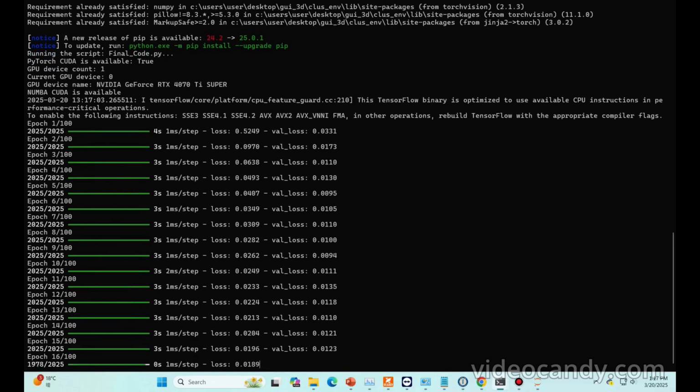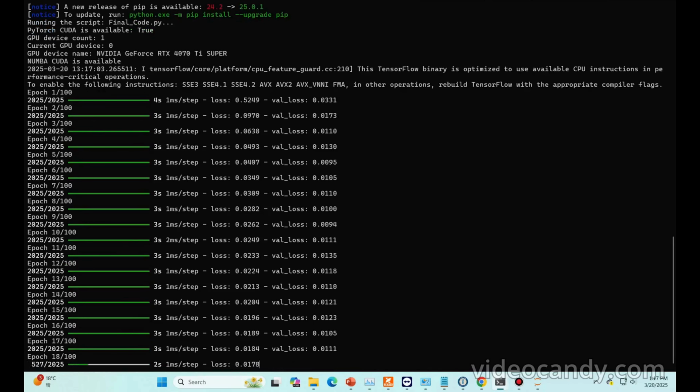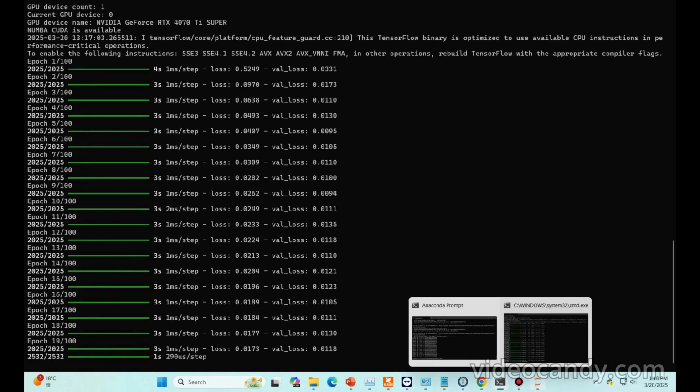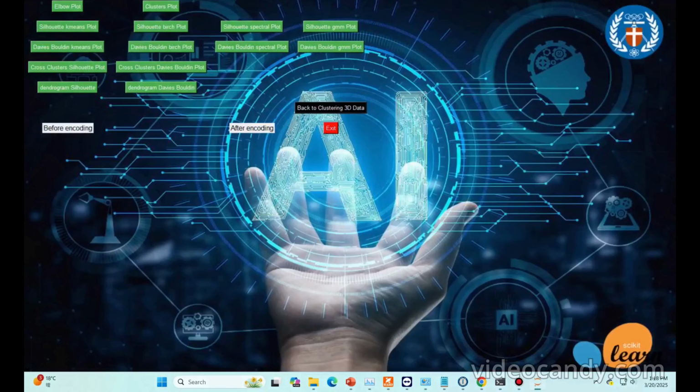Normally it is 5 to 10, but now it's taking more because I checked different separation powers, to evaluate your clustering methods like k-means, Birch, GMM, or spectral analysis. After the hierarchy for the initialized training, the clustering result can be displayed.